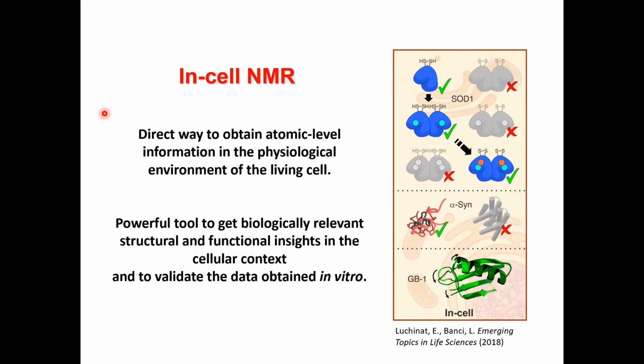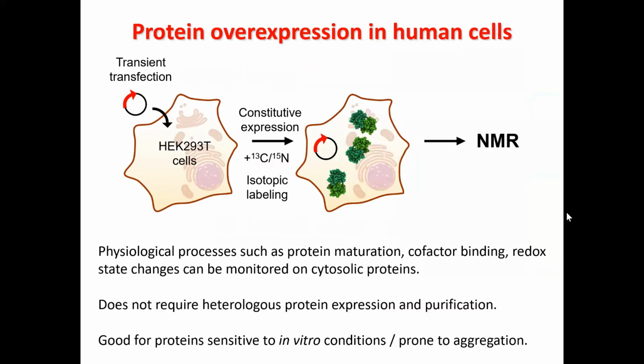As such, it's a very unique and powerful way to obtain biologically relevant structural information, and therefore functional information, in the context of a living cell, as well as a way to validate any data obtained in vitro to assess whether it can be reproduced and actually makes sense given the cellular context.